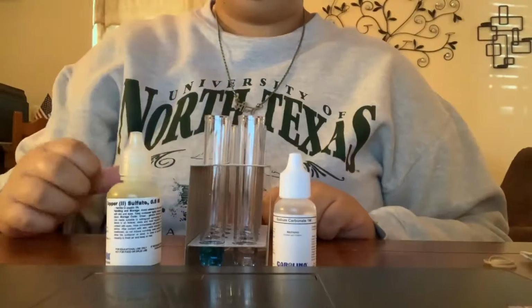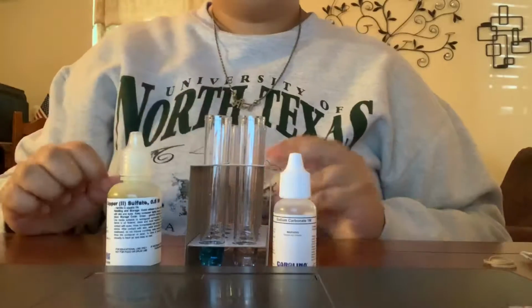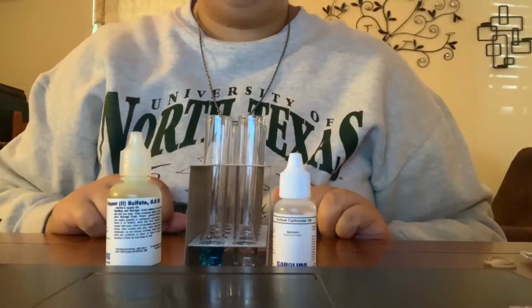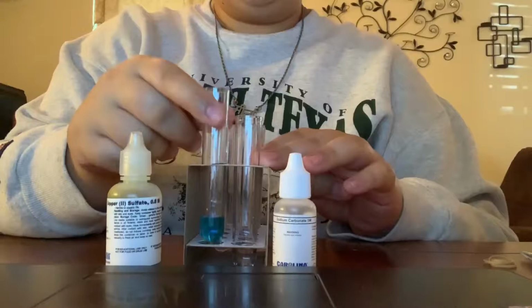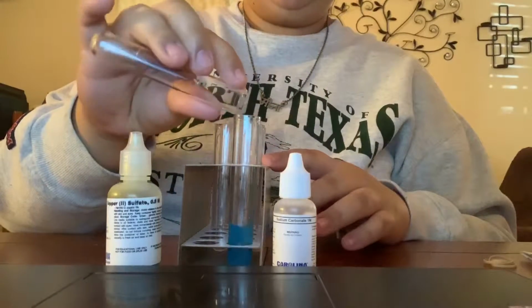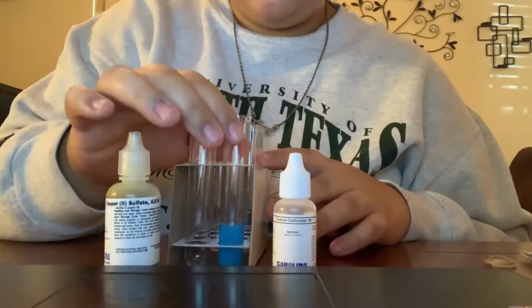Starting activity 3, I have 2 milliliters of copper sulfate in this test tube and 2 milliliters of sodium carbonate in this test tube. I have already recorded the color and temperatures of both of them separately. Now I'm going to mix them and record the temperature again. Mix. Fun. Okay.